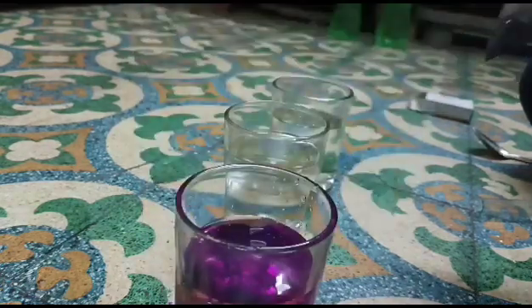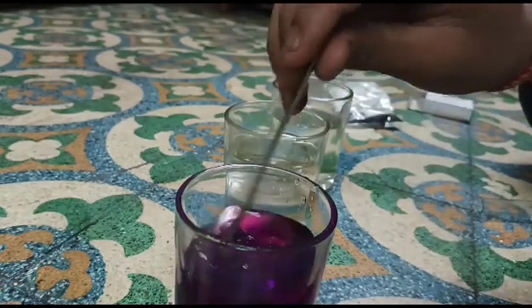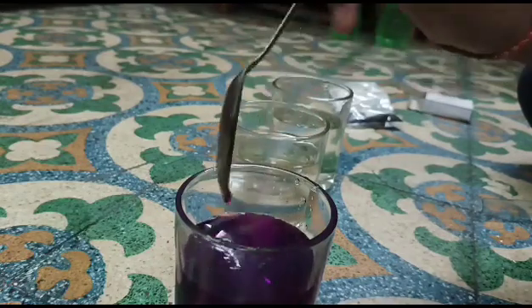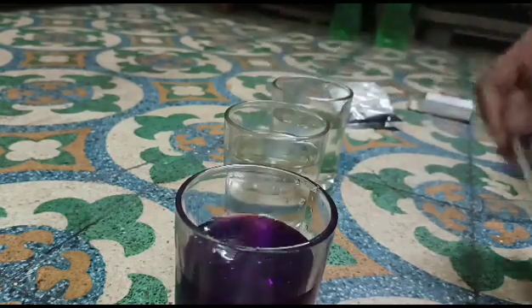Now stir it with the help of a spoon or anything else, a wooden stick, etc. Stir it properly. Now you can see this is the mixture of potassium permanganate and water, H2O.